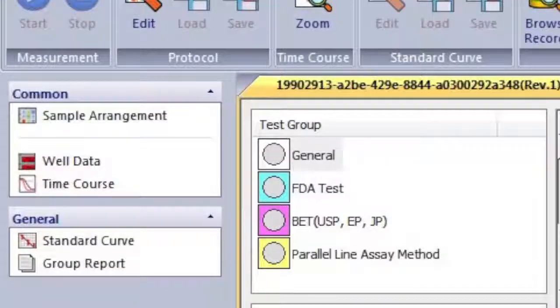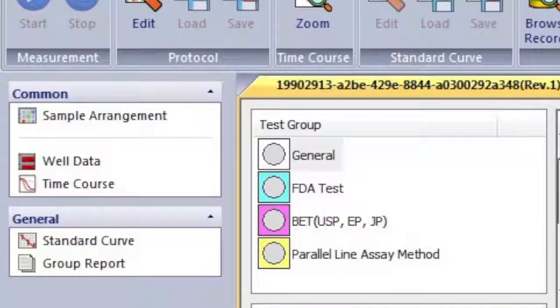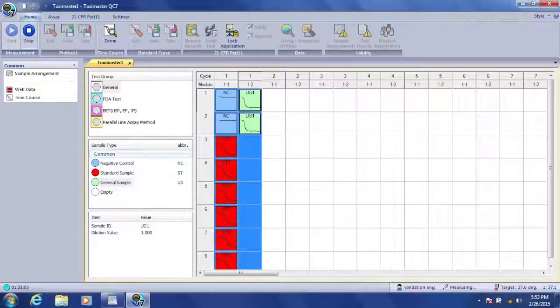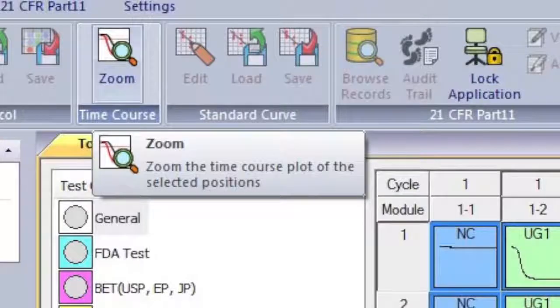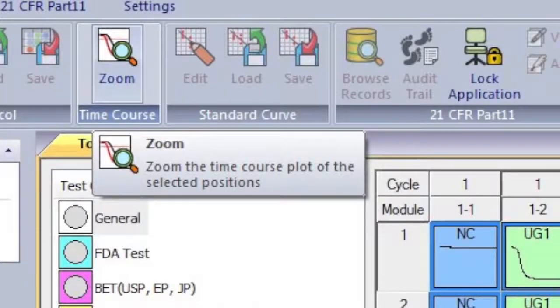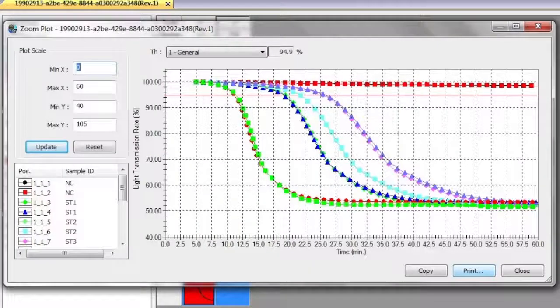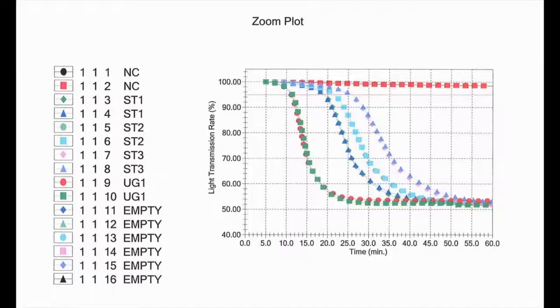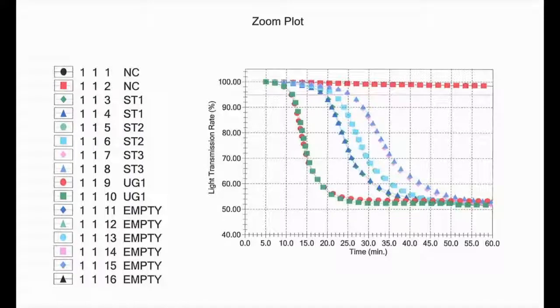After stopping the test measurement, you will notice to the left of the sample box the standard curve and group reports now added. To print the zoom plot showing your testing results, open the Zoom Plot menu and look for the Print button in the bottom right-hand corner of the box. The printout of our zoom plot is shown here.